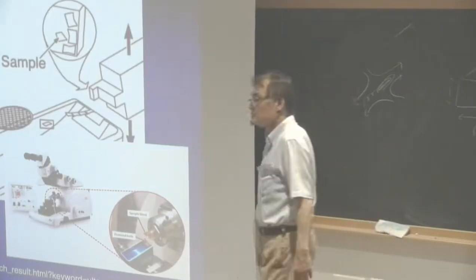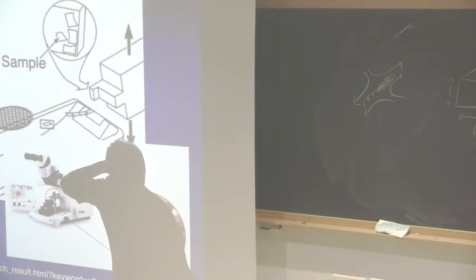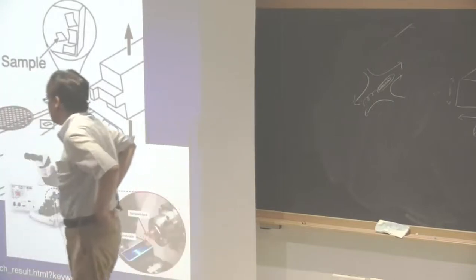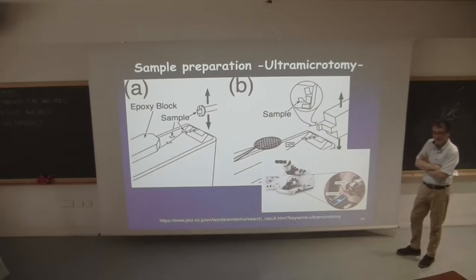Can it handle wet samples? What sample? Sorry. Wet samples with water content. Hydrogel. You could do that. It's difficult, but you can do that. Okay, hydrogel, it contains water. Yeah, cryo. Yes. That's okay.